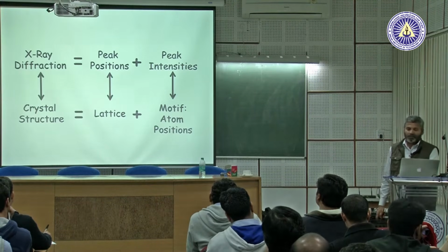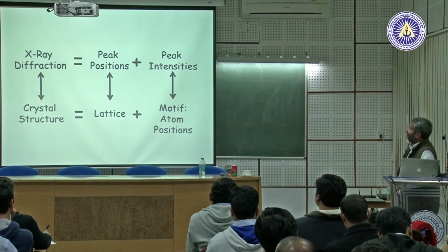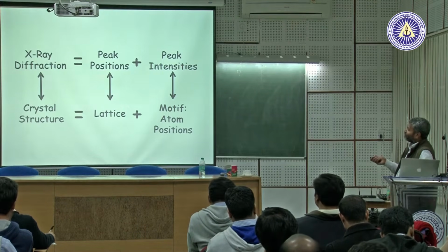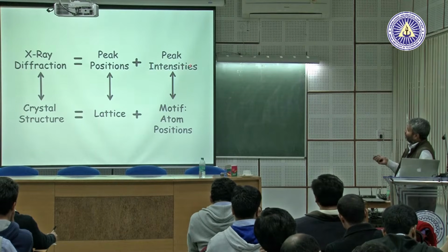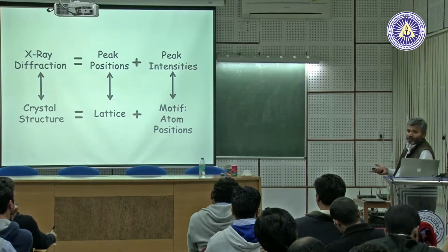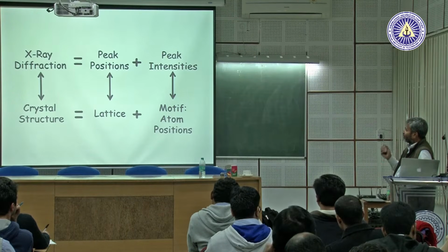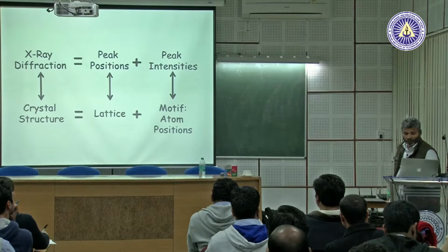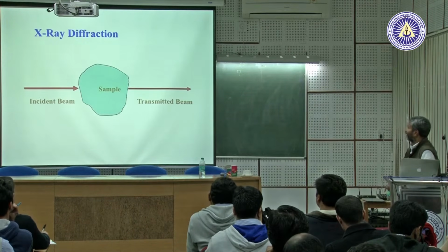So, crystal is equal to lattice plus motif, and the X-ray diffraction peak positions tell you what the lattice is, and the X-ray diffraction peak intensities tell you what the motifs are. So the peak positions are governed by the lattice, and the peak intensities are governed by the motif. We will look at these as we go.